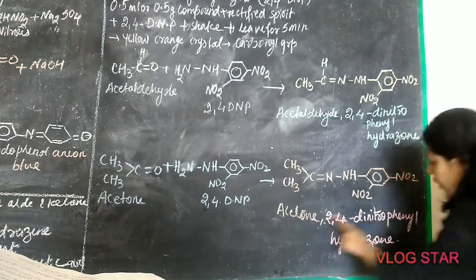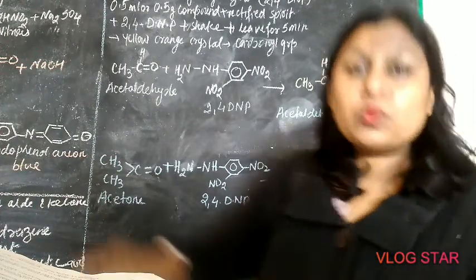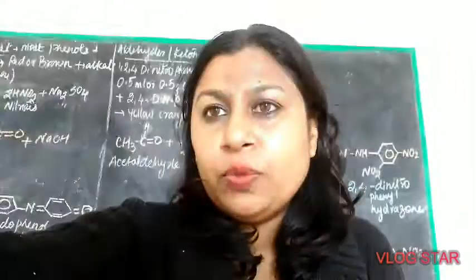This is acetone 2,4-dinitrophenylhydrazone. So this is one test to identify the carbonyl group.